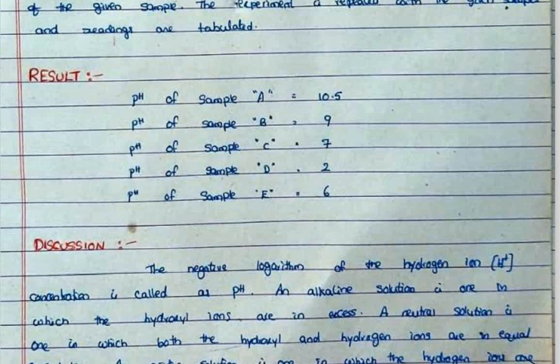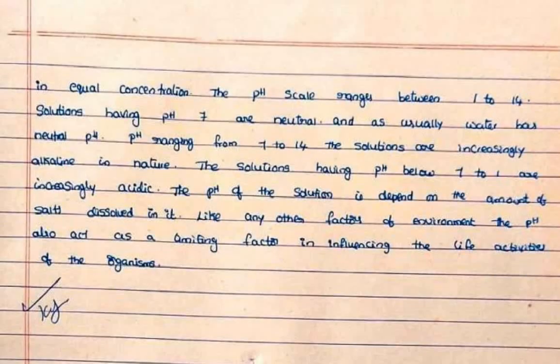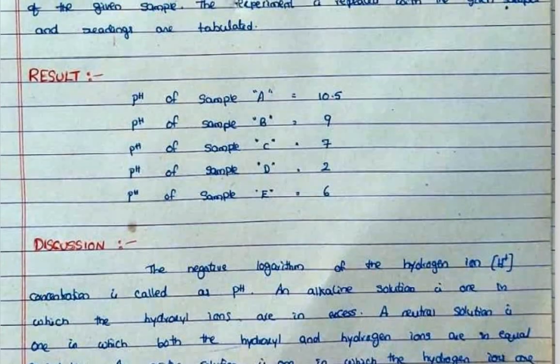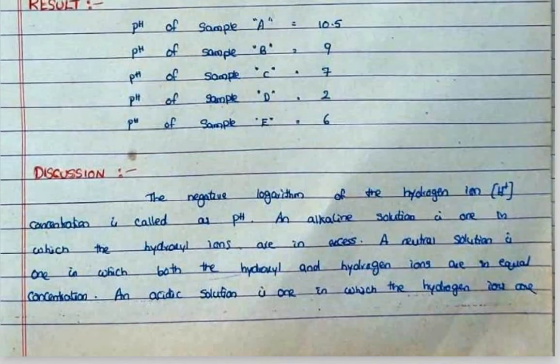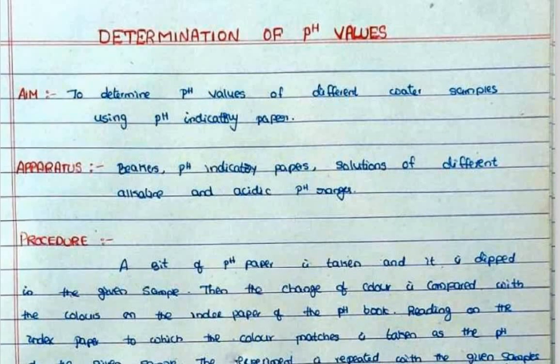Results: pH of sample A, pH of sample B, pH of sample C, pH of sample D, pH of sample E. After that, discussion.